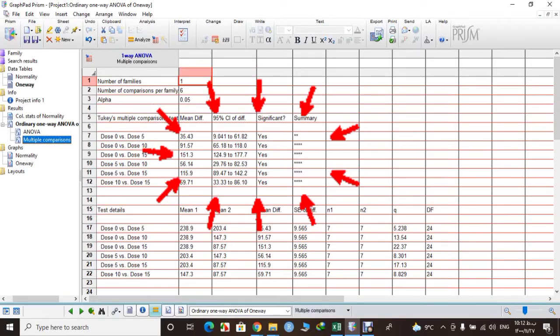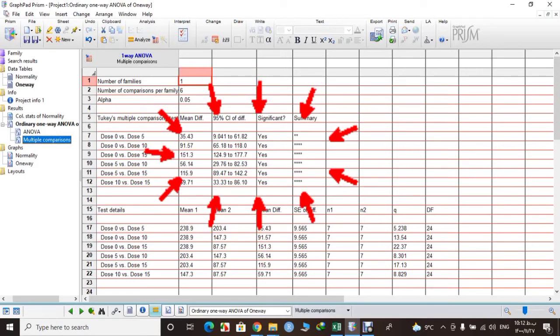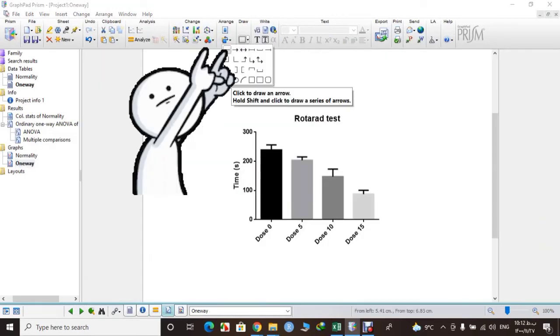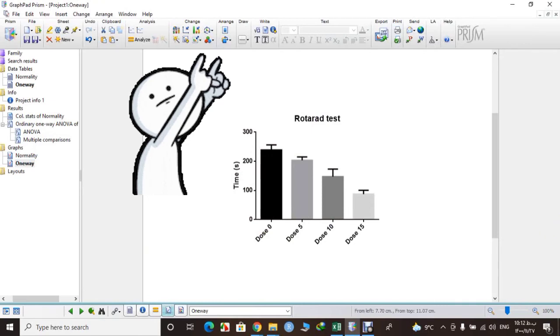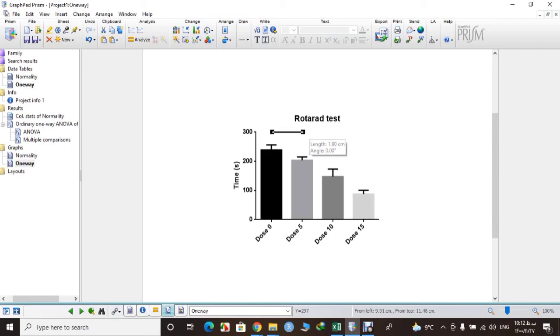So we can add it to our graph. Here is our graph. Okay, from the Draw tab, you can just draw a line here and show if our result is significant or not. So let's do it.